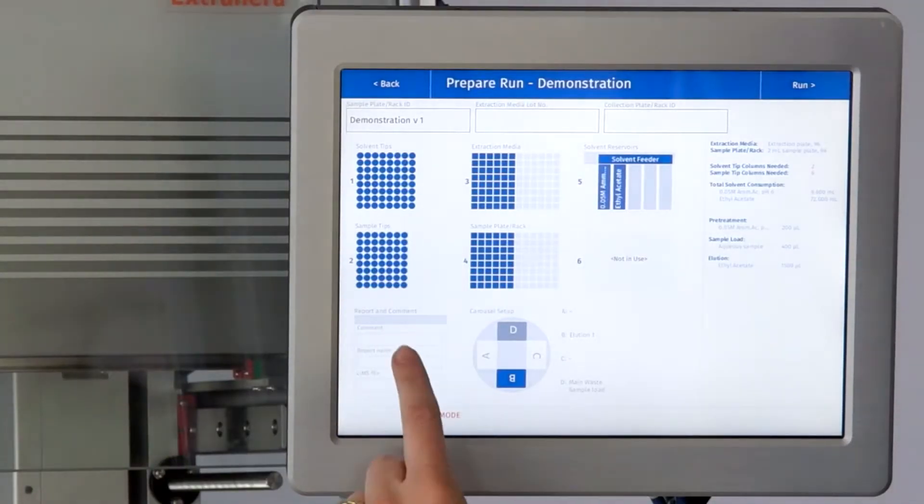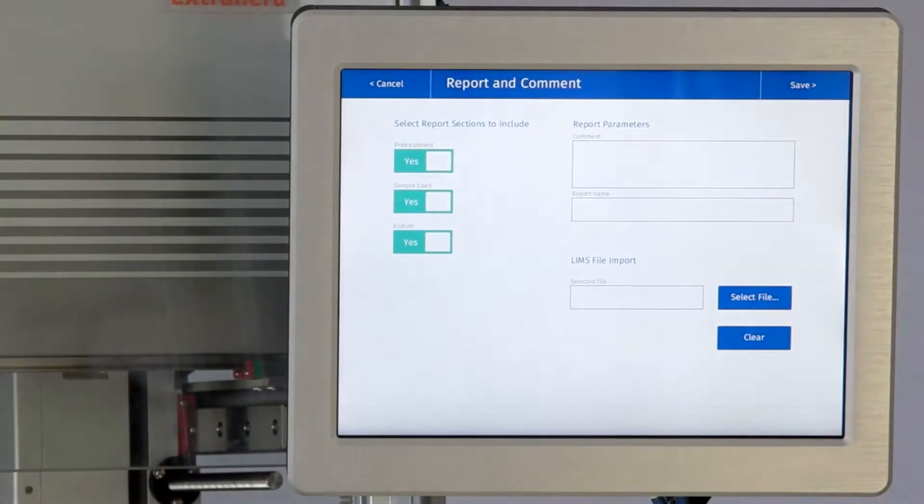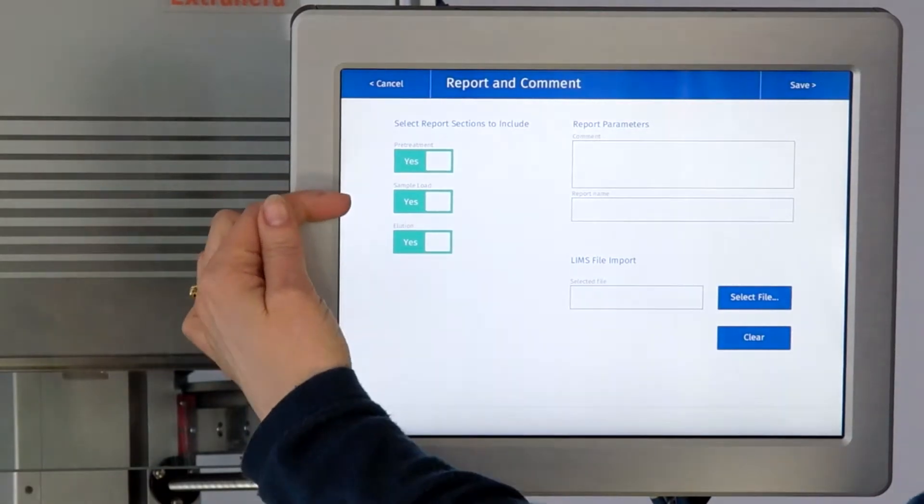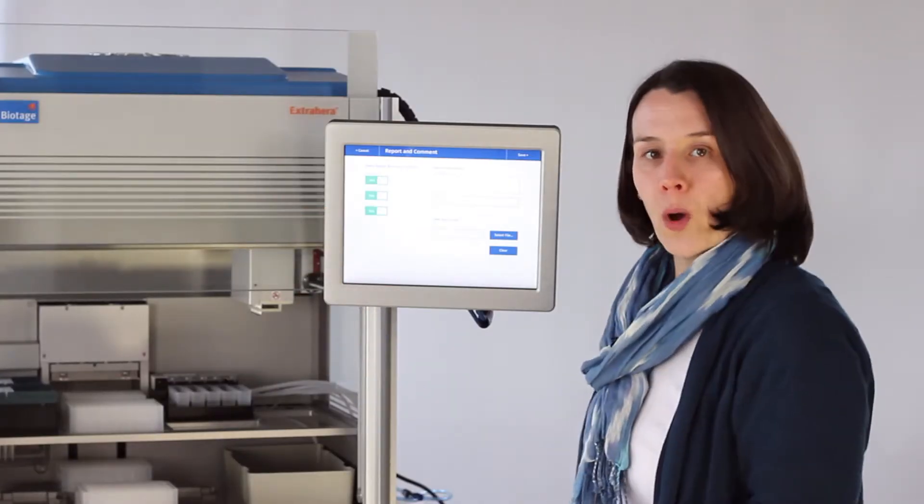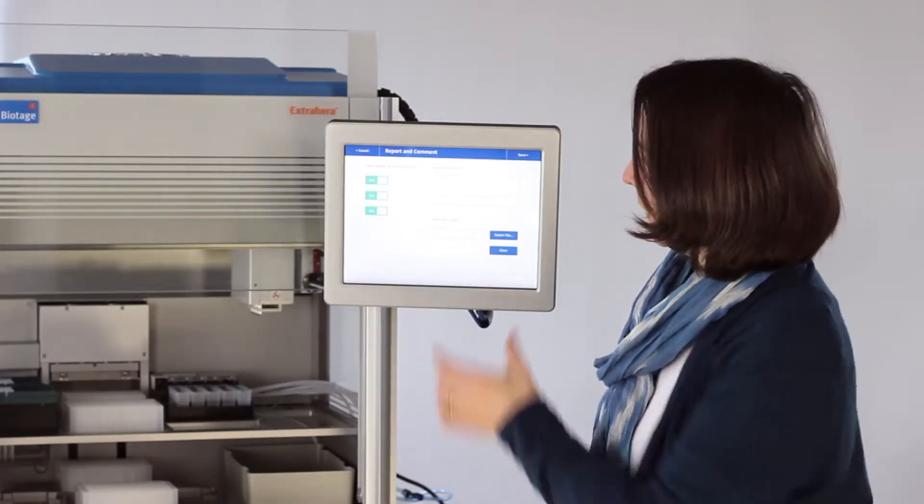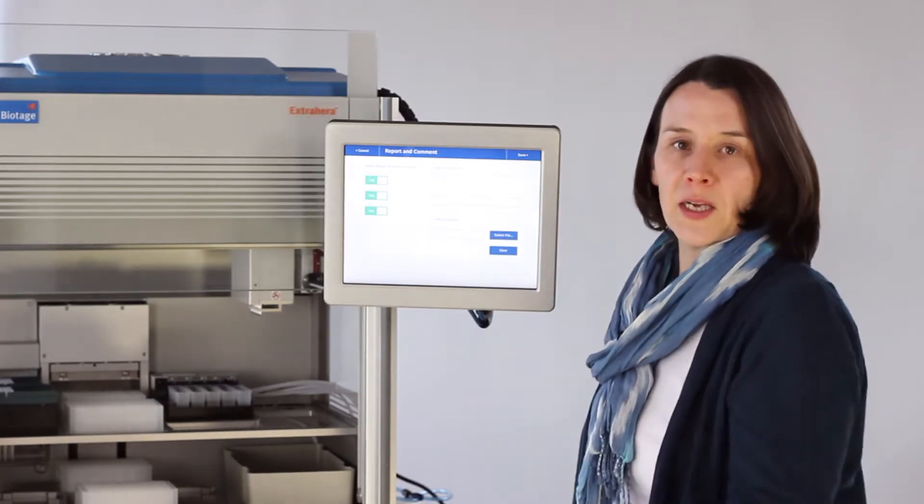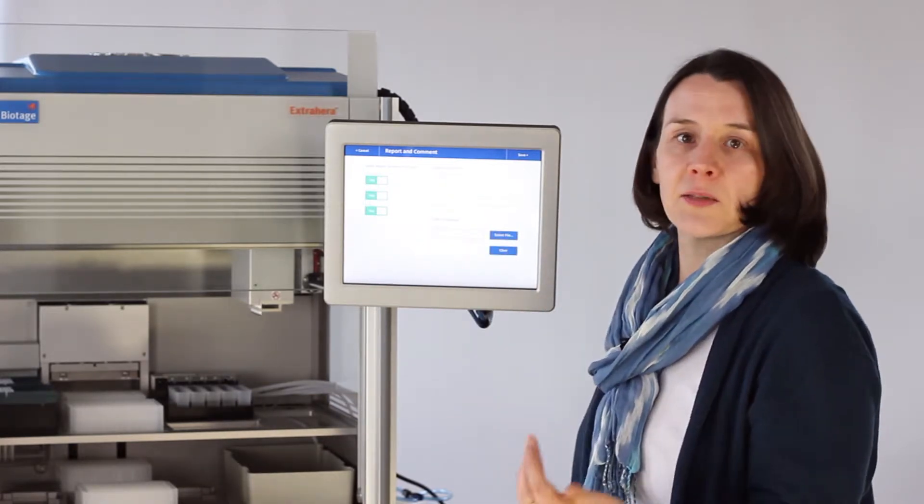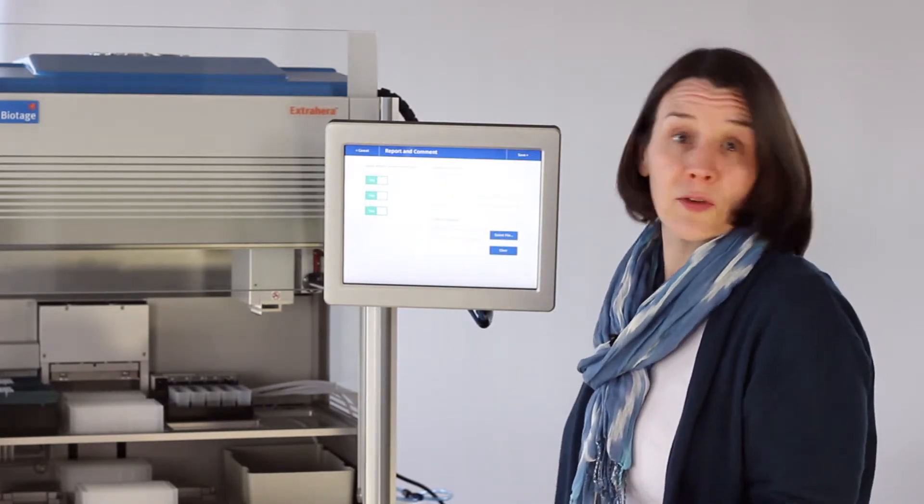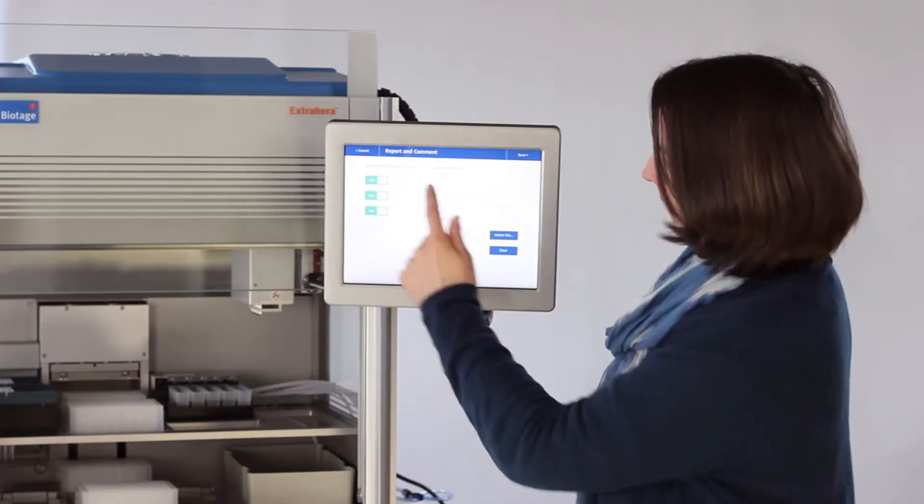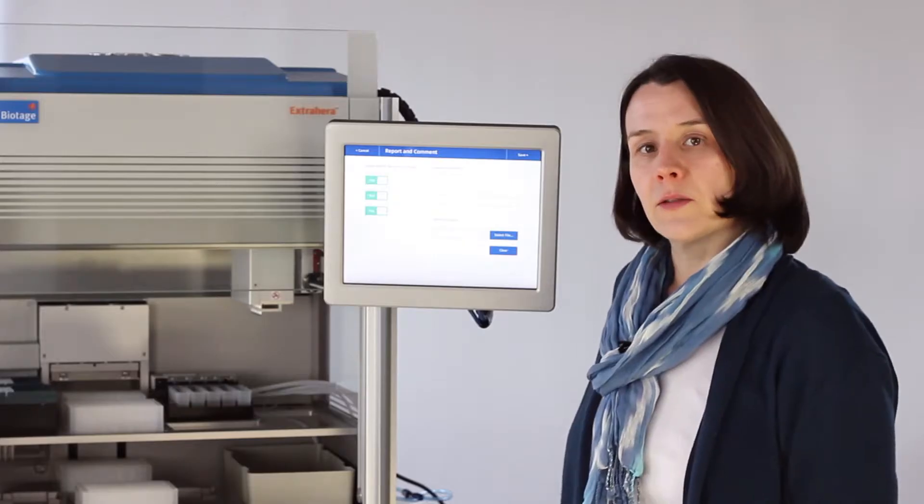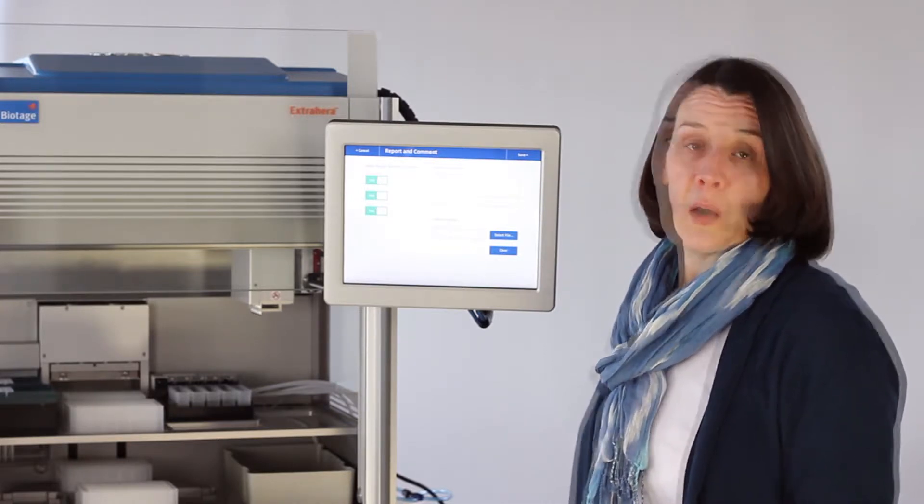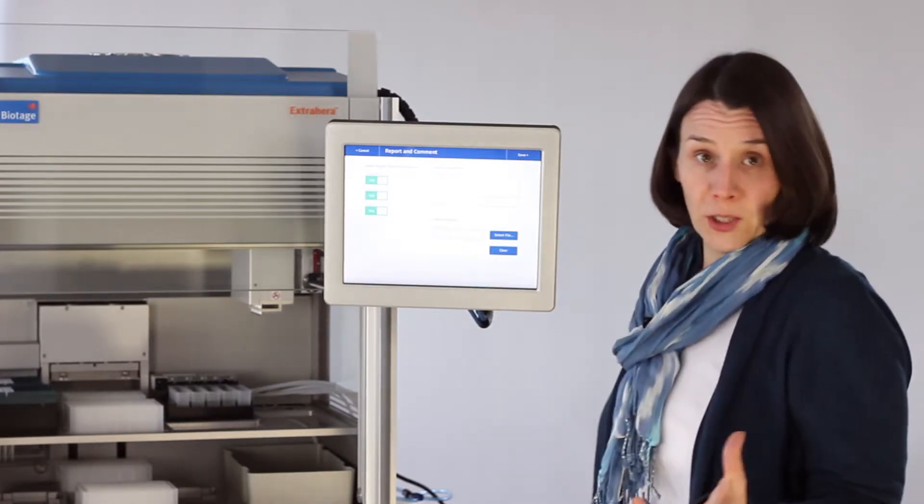Also we have a report and comment section. This means that you can choose the sections of the method that you want reproduced in the report. You can put a comment, so if a sample is particularly hemolyzed, for example if you were using plasma, you could make a comment here. You could also use that field to put in the analyst's name or the date or a batch number.